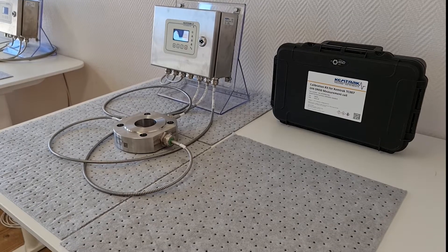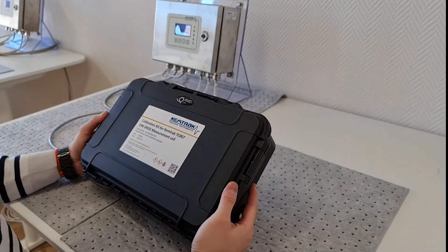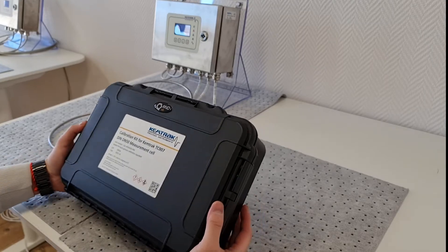Let's start by taking a look at the various items that come with the calibration kit. Don't forget to confirm the part number of the calibration kit matches the order and that it also matches the measurement cell it will calibrate.